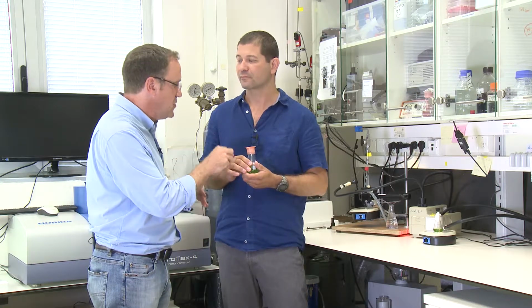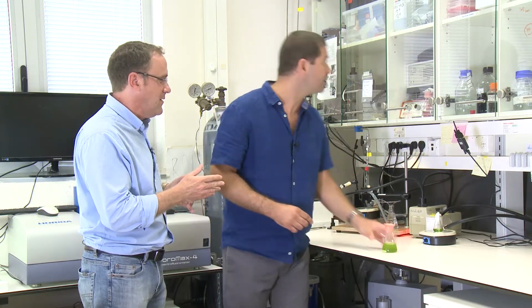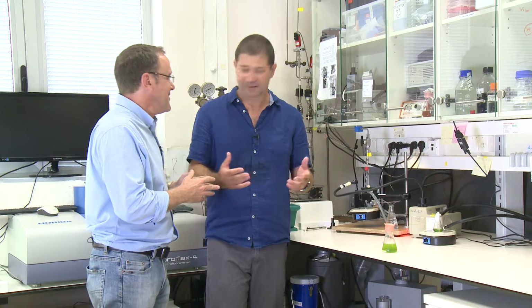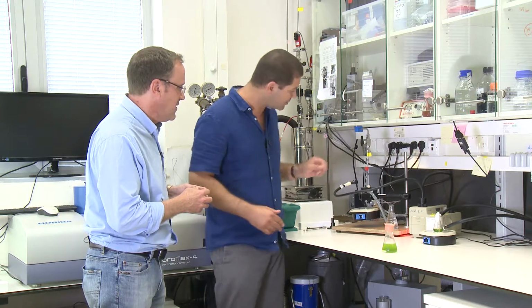You can monitor the oxygen that is produced by these algae. We monitor that in real time. How do you do that? It's very cool. We have here a mass spectrometer. A mass spectrometer is a machine that, like your nose, can smell small gas molecules. And we have a sniffer here. That sniffer is embedded inside a cuvette that contains those algae.